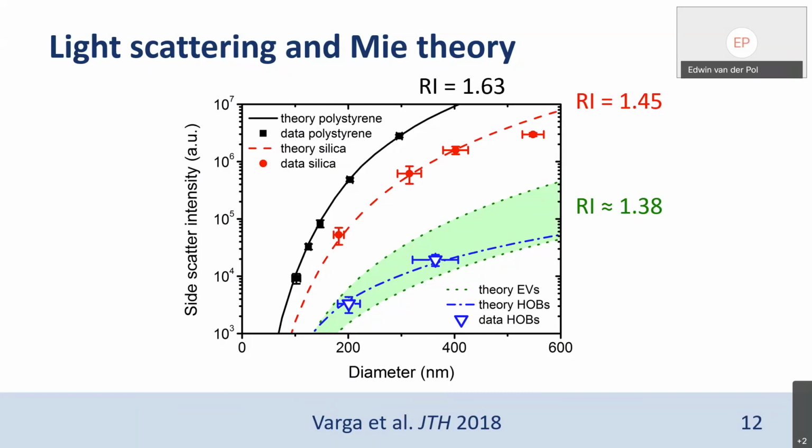I have to think what the name is. Metzler, thank you. It's a code of Metzler et al. So with the code of Metzler et al, you can calculate angle-dependent light scattering. What we add to this script is integration of the collection angles of the flow cytometer. At the moment, we don't make this publicly available because the scripts are partly commercialized by the company Exometry.